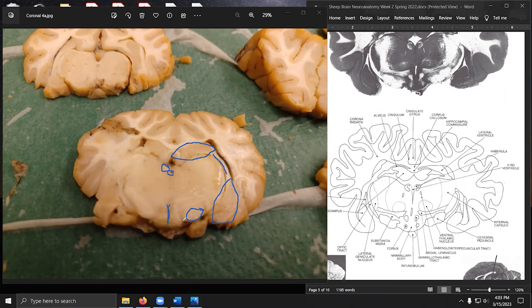The mammillary body, we can kind of determine by it being this thing that's sticking out of the bottom here. Remember that when we were looking at the sagittal section, we actually saw a bulge sticking downward behind where the hypothalamus was. That's the mammillary body, and we see a cross-section of it right here. Looking further, I'm not sure that we could quite make out everything that we want to here. The optic tract would be roughly about here-ish. I'm not sure if this is it or if this is part of the hippocampus. Again, it's a blurry picture, so it's a bit hard to wrangle with.